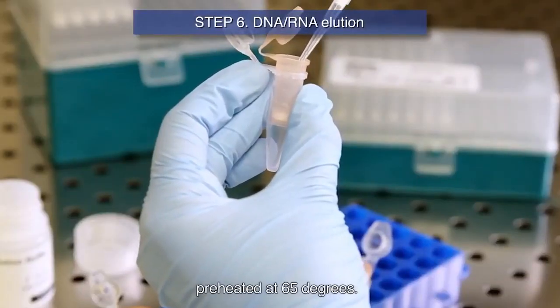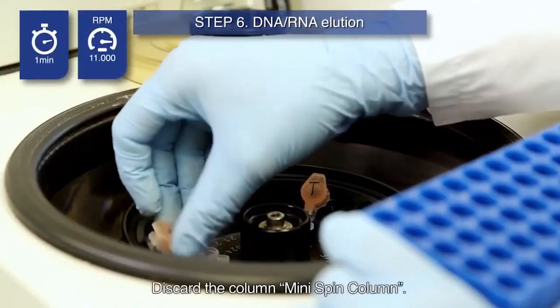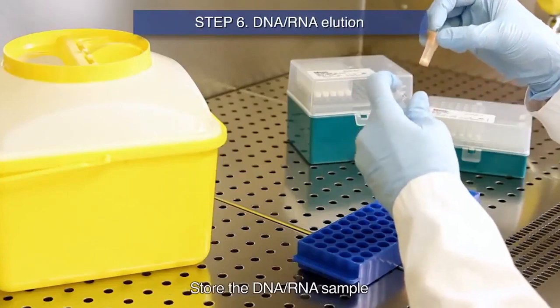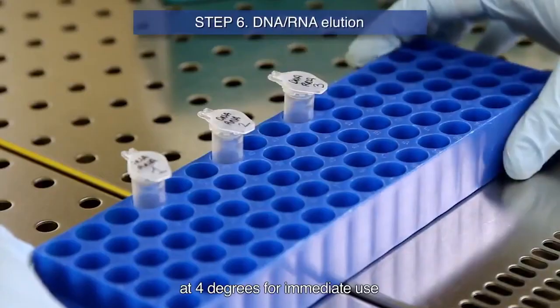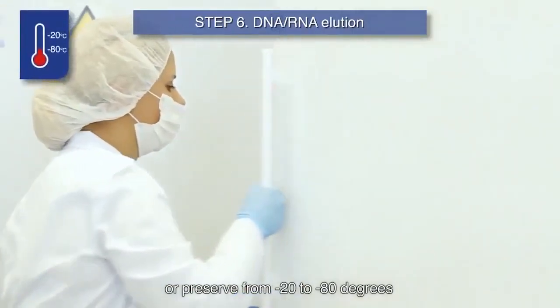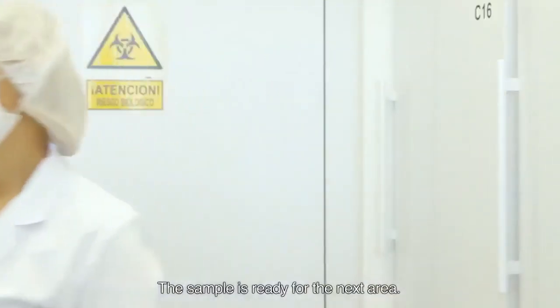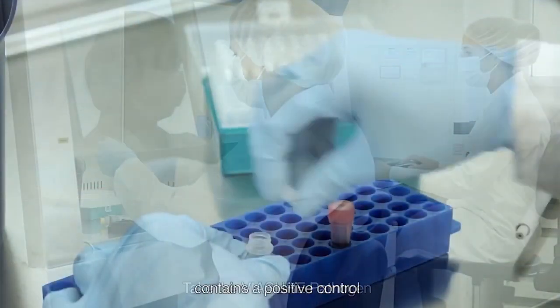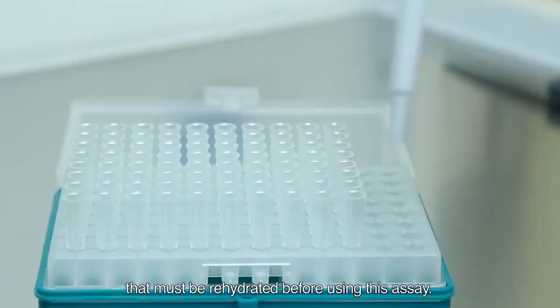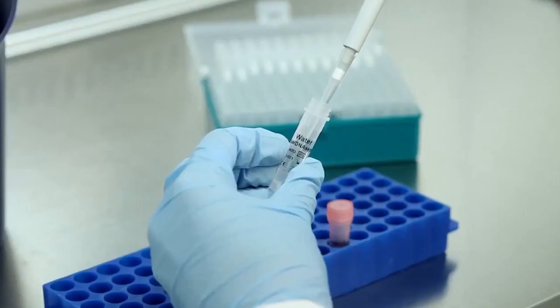The nucleic acids are finally eluted from the membrane using elution buffer. Place the mini-spin column in the sterile 1.5 ml collection tube. Add elution buffer preheated at 65 degrees. Incubate at room temperature and centrifuge. Discard the mini-spin column. Store the DNA-RNA sample at 4 degrees for immediate use or preserve from -20 to -80 degrees for longer periods. The sample is ready for the next area.